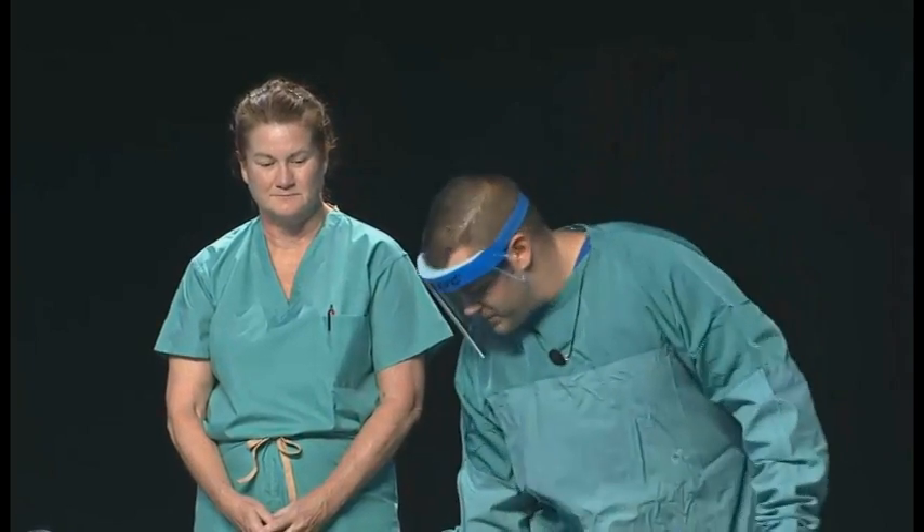Today, I'm going to be Barbara's trained observer. As such, I need to wear a gown that is fluid-resistant, shoe covers that go up to my mid-calf, gloves, and this face shield to protect my face.